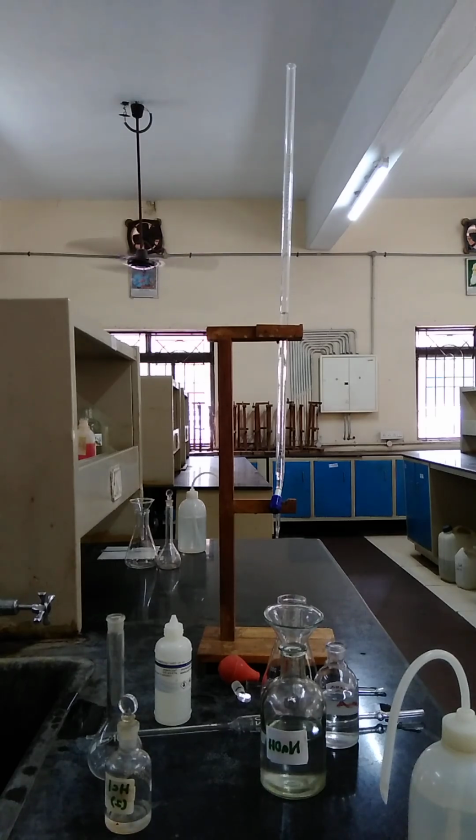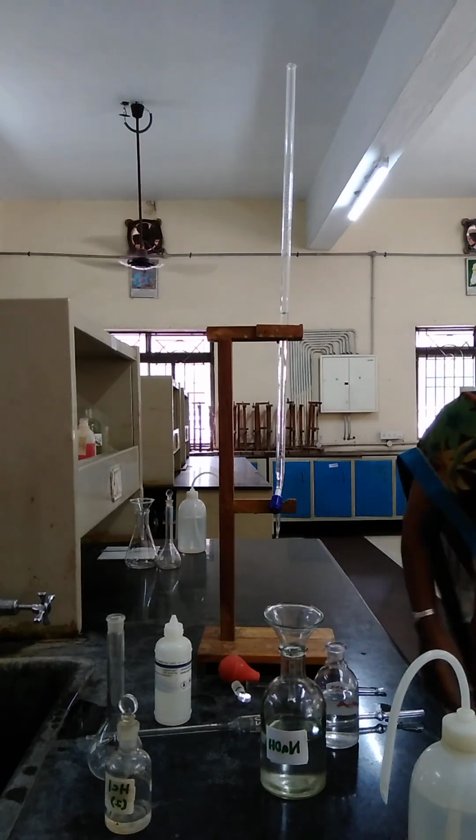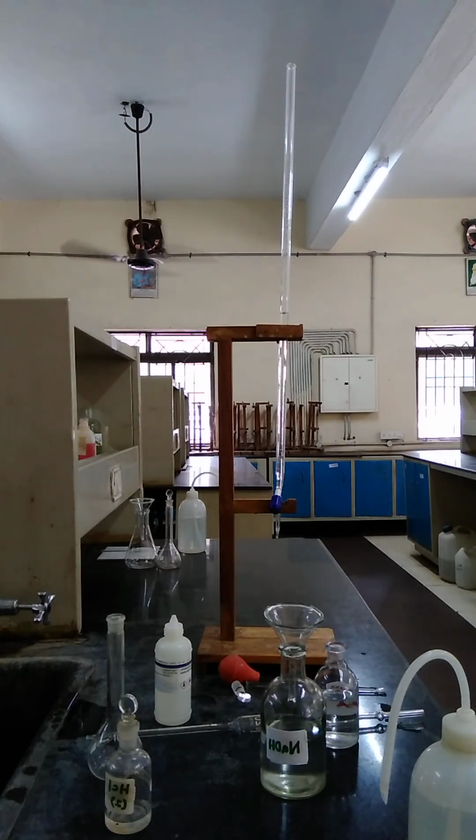Now we are going to make up the given sample HCl. We have to wash the standard flask, which was already shown in the demo class, with distilled water. Now we have to transfer the HCl into the standard flask, then make up with distilled water. As I already told you, once you transfer the sample, we have to wash the reagent bottle 2 to 3 times. Only then do we add the distilled water into the standard flask. Just do it. We make up.